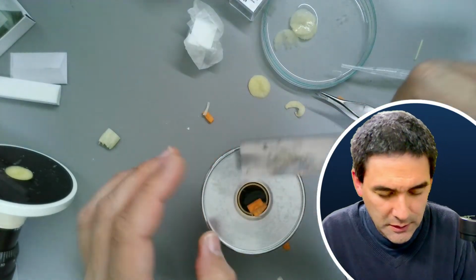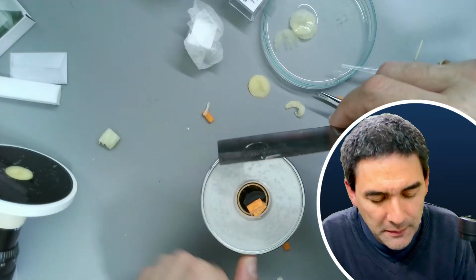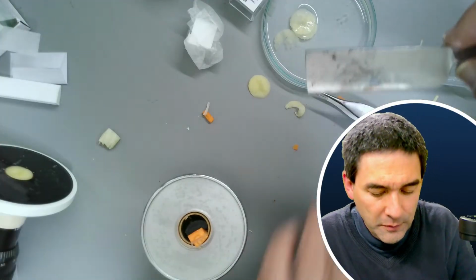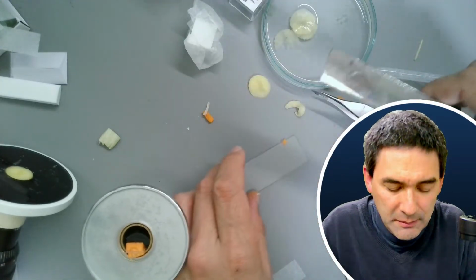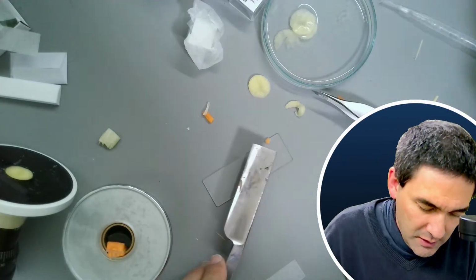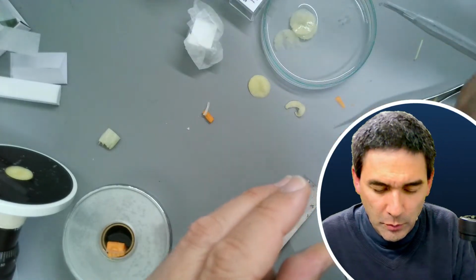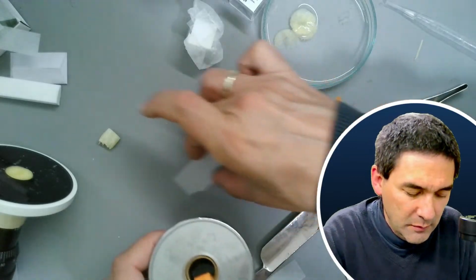Here we go. Okay, we can try to put this now under the microscope. Yeah, hoping that it's able to be on the edge. Sometimes it flips over and then you're still only getting the top view. Here there is some separating paper. My table is a complete mess. That's okay. And here it is. We put it in here, hoping that it didn't tip over. Okay, if not, then I'm going to try another one.